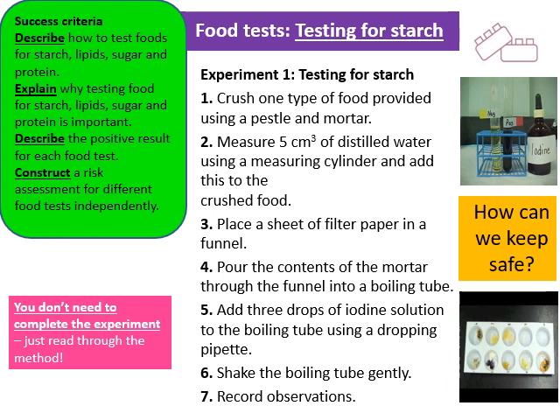Can you just read through this now, make sure you're happy with the method and think about what sort of things we need to be aware of to make sure that we can keep ourselves safe if we were to carry out this practical.